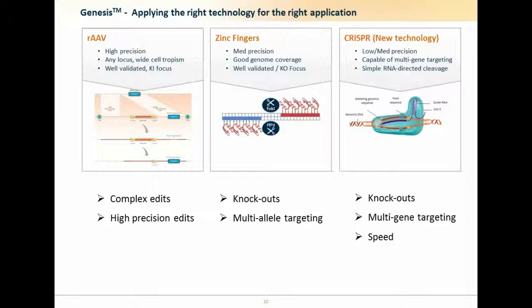There is one technology maybe you might think missing from this. That's the TALEN technology. And really, with zinc fingers and CRISPR available to us, we didn't feel the need to bring in TALENs, but I would put them right up there and make them fairly equivalent with zinc fingers and CRISPR in terms of having a nuclease technology to undertake these types of things.